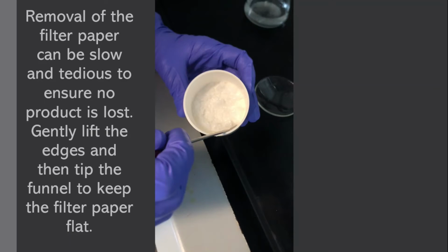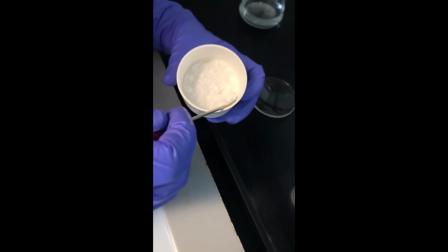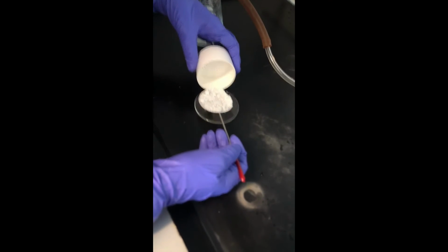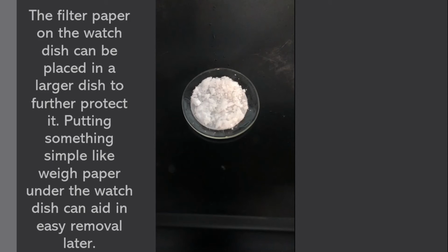And when you're removing the filter paper, you're just going to want to run a spatula or a scoopula around the edges to gently lift it, and then tilt the Buchner funnel over, keeping the paper flat so that you don't lose any of that solid product as you're removing the filter paper, and just putting it onto a watch glass so that we can get it ready for drying.